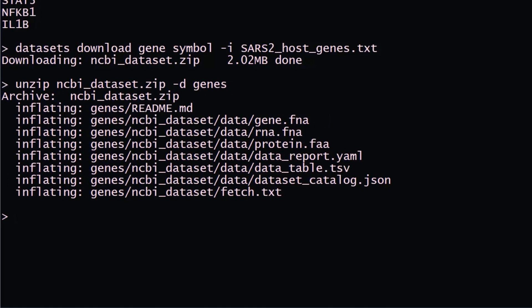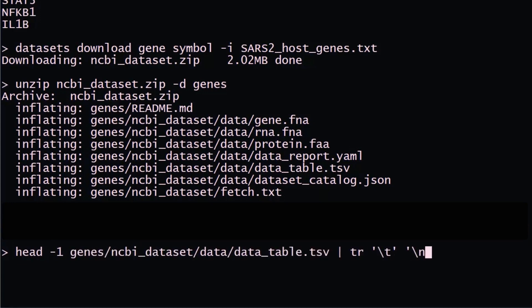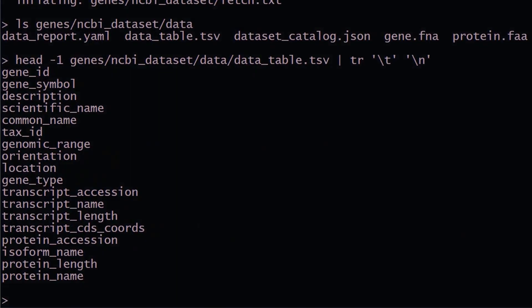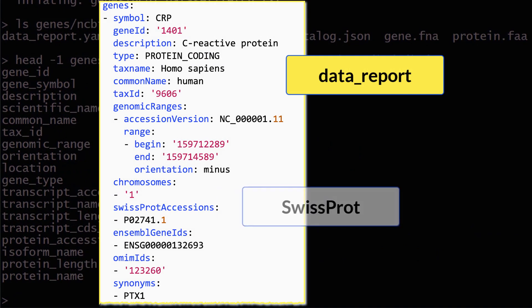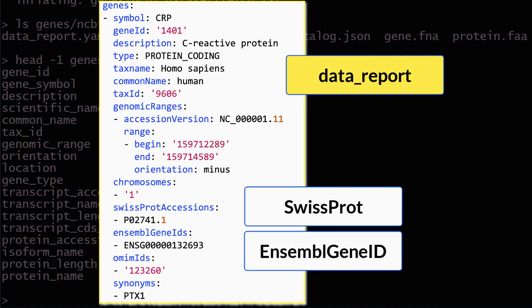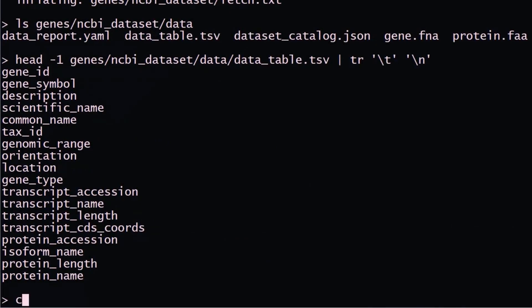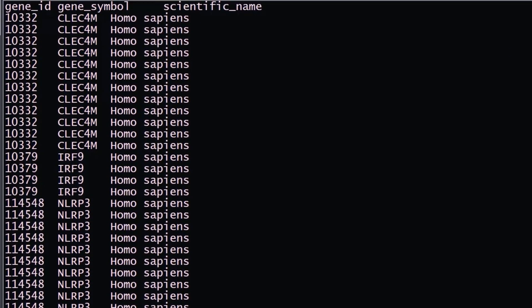Note that we plan to move to the JSON lines format for the data report file. The data table contains a range of gene information for the gene, the transcripts, and the proteins, as well as additional data such as the external identifiers for SwissProt and Ensembl Gene IDs. With standard UNIX tools, you can parse the available data fields to build a custom table of the gene information you need.